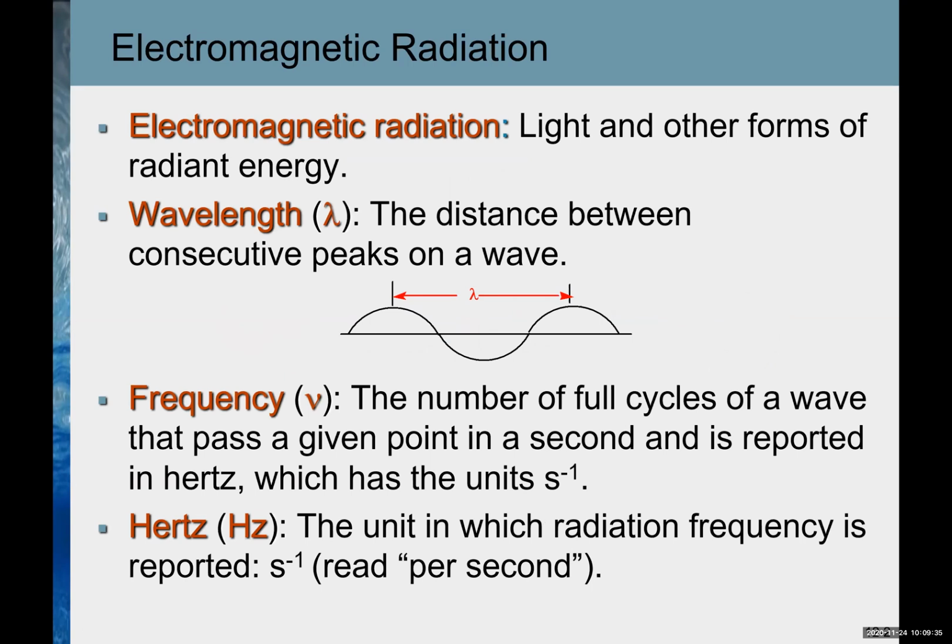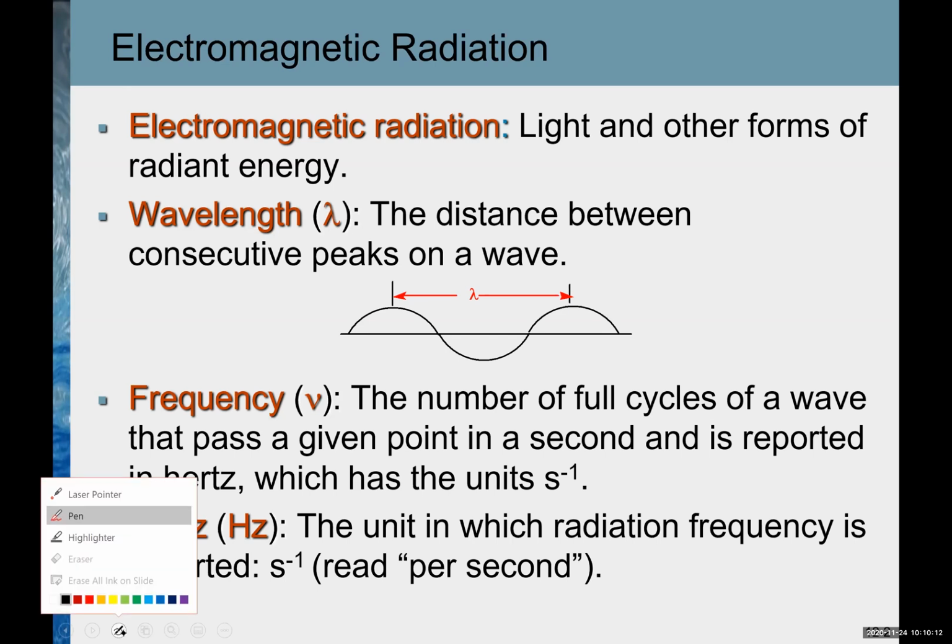So before we look at what infrared spectroscopy does to molecules, let's clear some of the concepts about radiation. All radiations are electromagnetic radiations. It means that they have two components. For example, if we look at visible light or ultraviolet light or any other radiation, they will have an electric component.